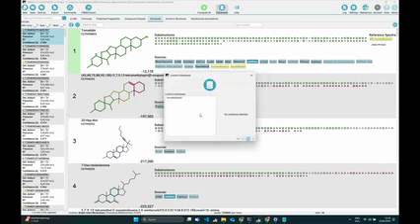And if we open this, this is pretty much instant. You will now see this custom database is also inside, which now contains actually 1,100 compounds. So with this BioTransformer, we really added a very big list of possible biotransformations of this tomatidine structure.